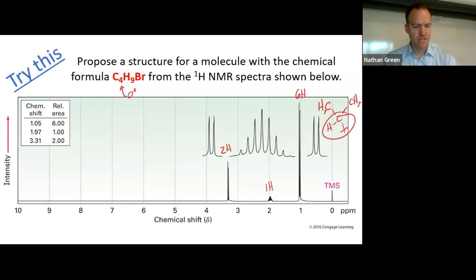So Rachel's question was, I put 2 CH3s because there were 6 hydrogens. Yes. And something that's different about this one compared to the others, this is 6 hydrogens, but notice this is 2 and 1. So the entire molecule doesn't have to be symmetric. It's just this piece that's symmetric. So I have two CH3s that are twins. I put my CH3s on a CH because this signal was a doublet. So I know that my 6 protons must neighbor only 1 proton. Well, that's this guy.